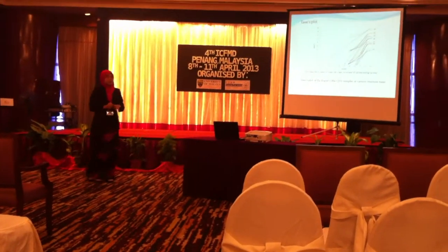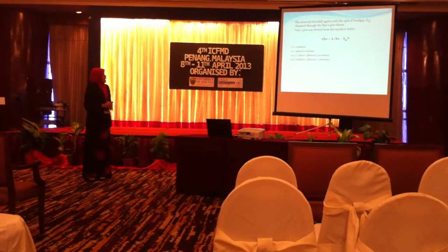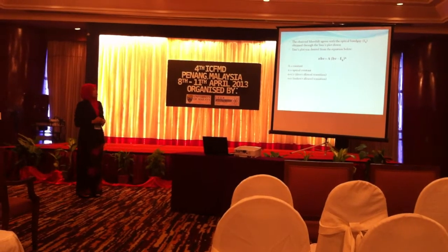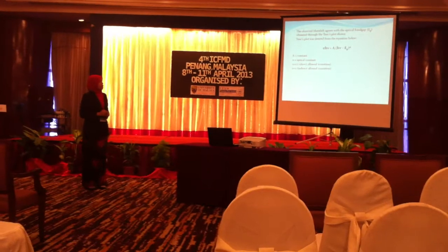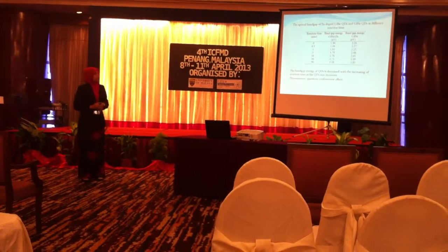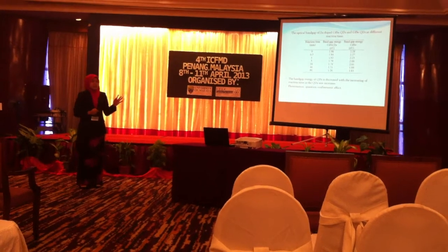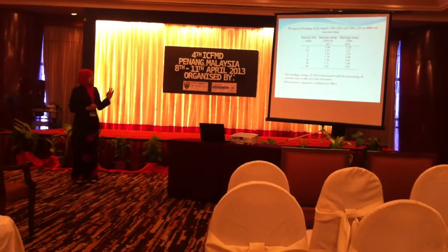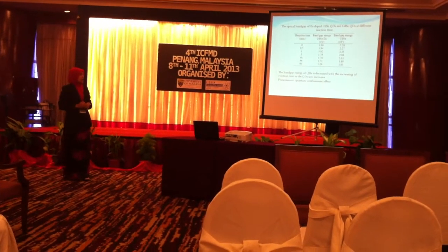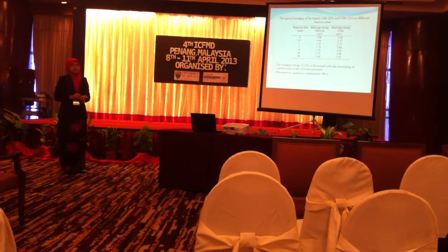Okay, the Tauc plot is obtained from the UV-vis result, derived from the equation below, the Tauc equation. So the observed color shift agrees with the optical band gap obtained through the Tauc plot. So from the Tauc plot, I obtained the band gap energy for zinc-doped cadmium selenide, and I compare with the previous literature for cadmium selenide band gap energy. So the band gap energy of quantum dots decreases with the increasing of reaction time as the quantum dot size increases. So this phenomenon is called the quantum confinement effect.